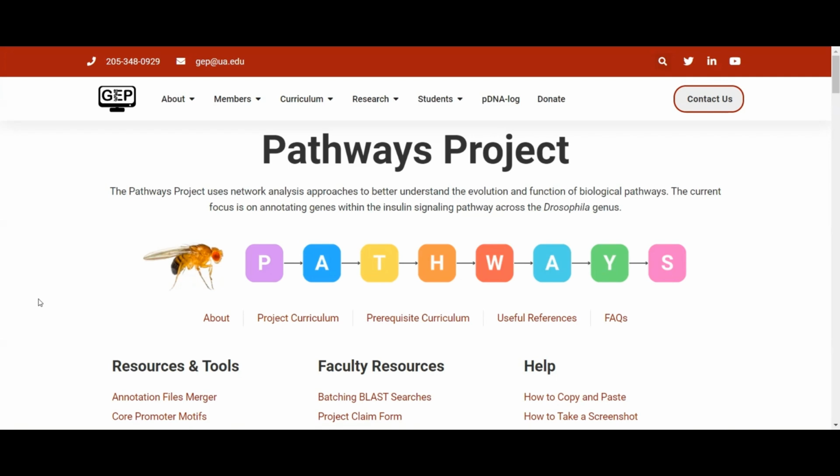Now that we've completed the annotation of Rheb-PA in D. yakuba, we need to verify our proposed gene model and prepare the corresponding sequence files for submission. Our analysis of the CDS by CDS tBLASTn alignments and the evidence tracks on the genome browser allowed us to precisely define the start and end positions of each of the 5 coding exons of Rheb-PA.